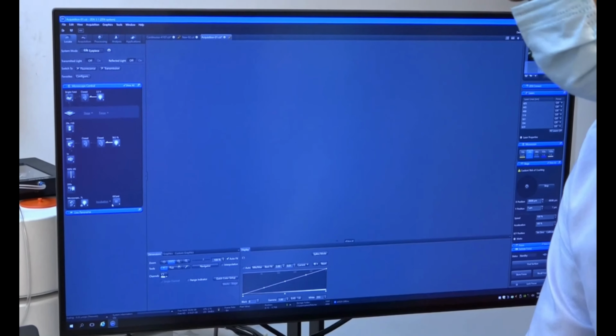So by setting the eyepiece here, I am going to focus based on these two knobs. So this knob is actually for adjusting the Z position, to see whether the sample is in plane of focus or not. There is a joystick here, with the joystick I can change the XY movement. So now once I have positioned and focused my sample, I can see it, the signals are good enough, I would like to acquire those images in a laser mode.